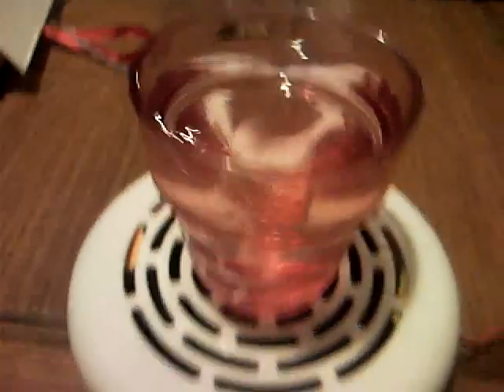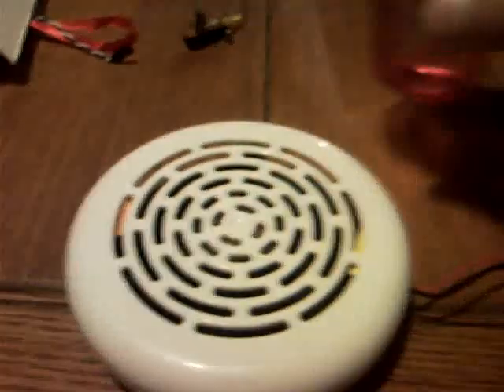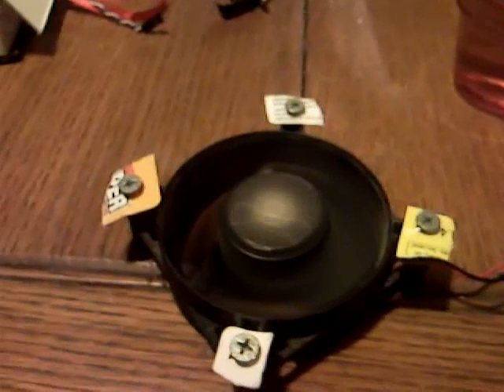I took the back off the case and I run these two lines, so you can see the inside working with this. And as you can see, it's a hard drive magnet mounted to a regular computer case fan.